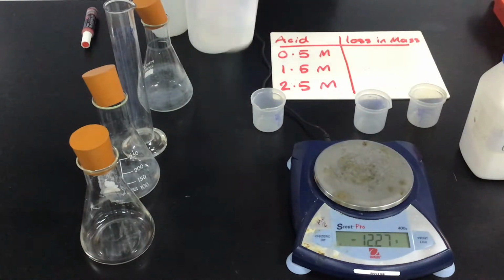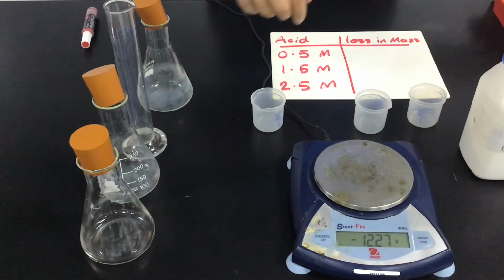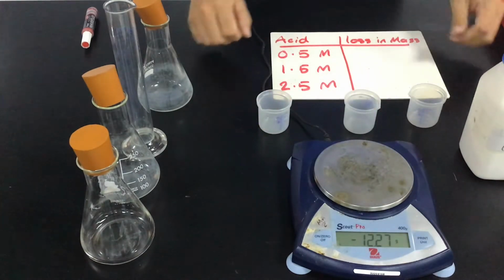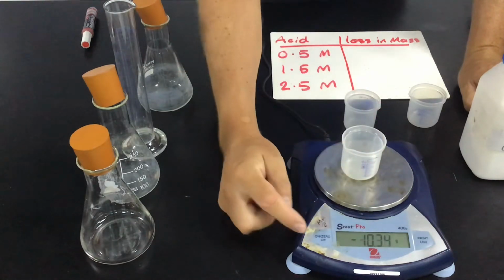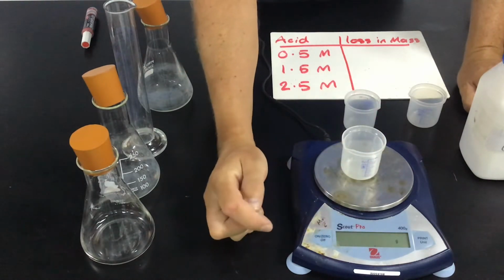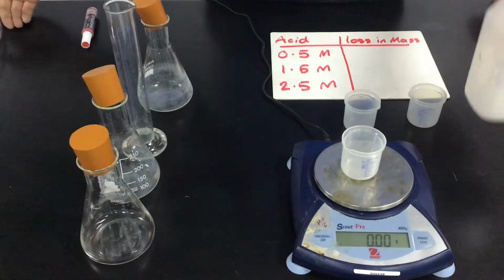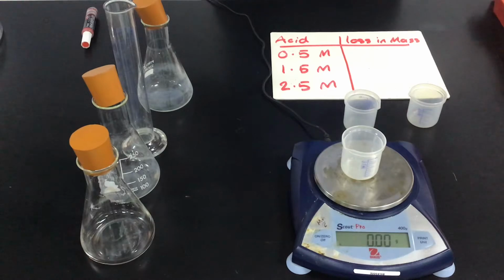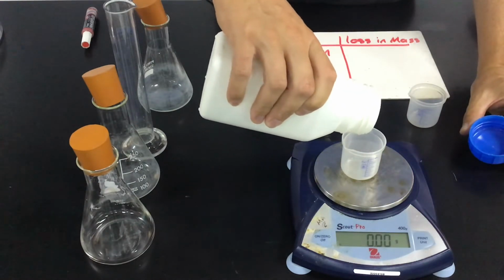So my first job is I want to measure out the same amount of marble chips for my 3 different experiments. That's going to be one of my control variables. So I'm just going to place on a beaker and zero it, and then we are going to attempt to have 5 grams. Let's just see how much 5 grams looks like.